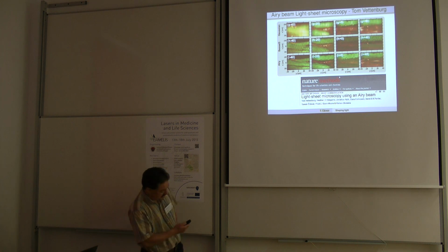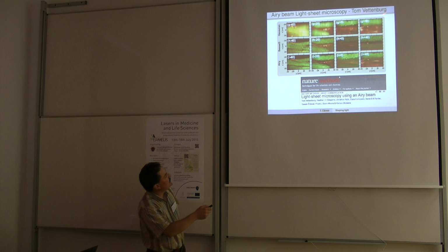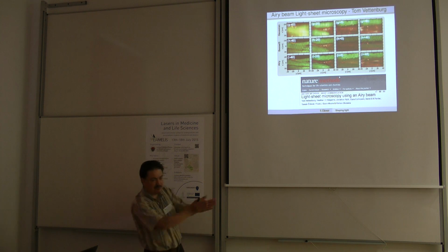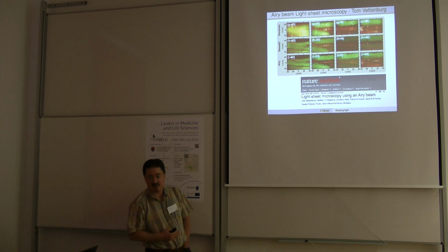So just to show you the advantage, these images are all taken in focus, and you can use a Gaussian beam, Bessel beam, or the Airy beam. But if you move away from the focal plane, the Gaussian beam degrades really quickly because of spreading, right? So you can see it's pretty fuzzy here. The Bessel beam is rubbish all the time, while the Airy beam is actually very nice, even if you go really far from the focal plane.